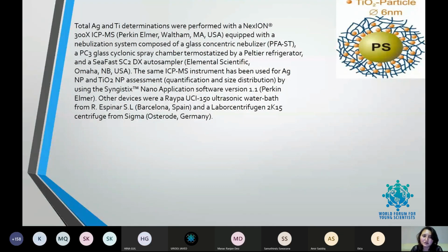Before measurement, we centrifuge urine. Why do we need centrifugation? You know that in urine we have some amount of protein, and we must separate this protein from urine, and for this we must use centrifugation.